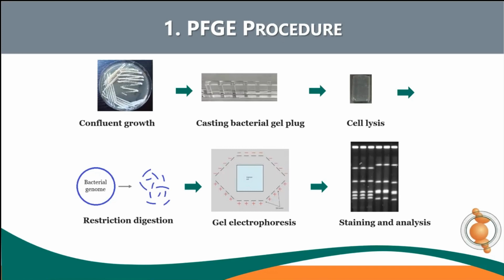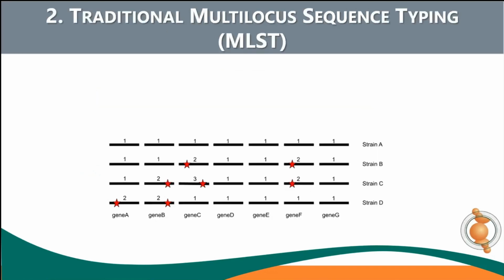Smaller DNA fragments will migrate faster on the gel, so they can show different patterns. After running gel electrophoresis, the agarose gel is stained and observed under the UV light. As you may notice here, the final DNA patterns are based on the digested DNA fragments. Strains showing similar DNA patterns are suggested to be the same strains. But this method is not sensitive enough to differentiate some strains with similar but not identical genomic DNAs.